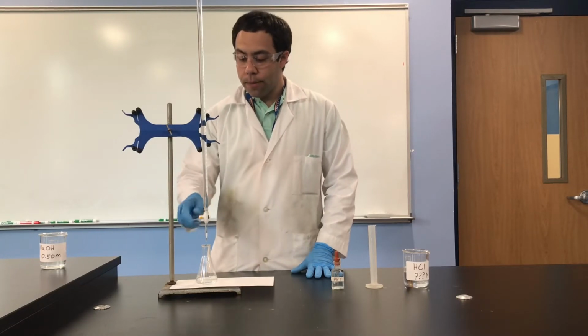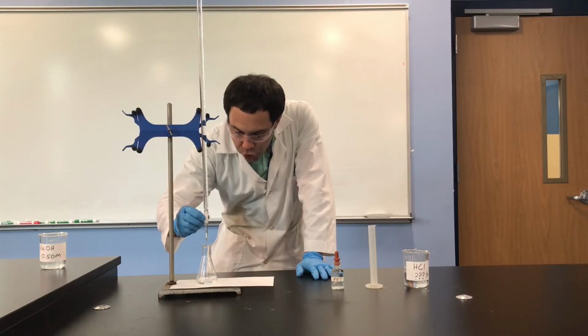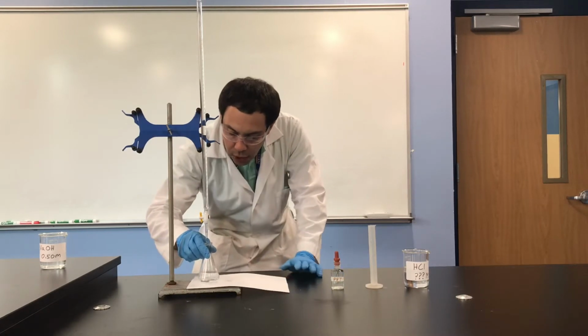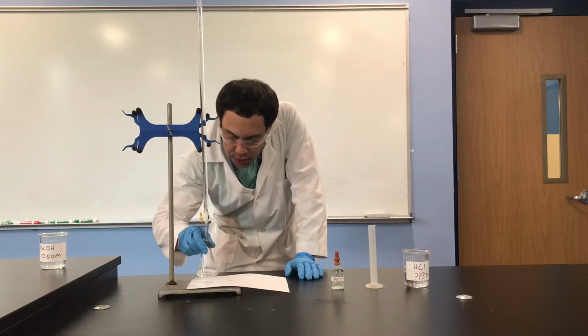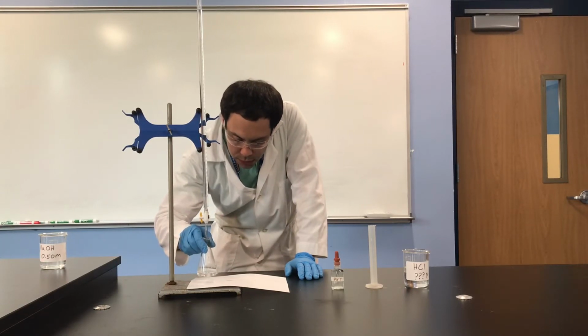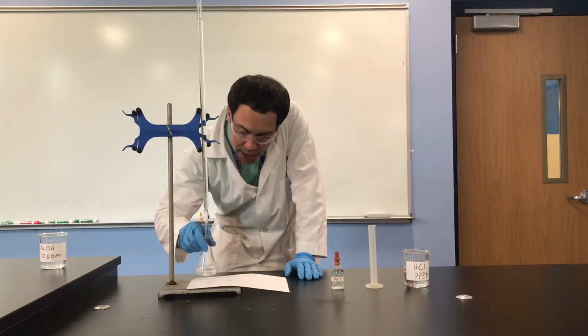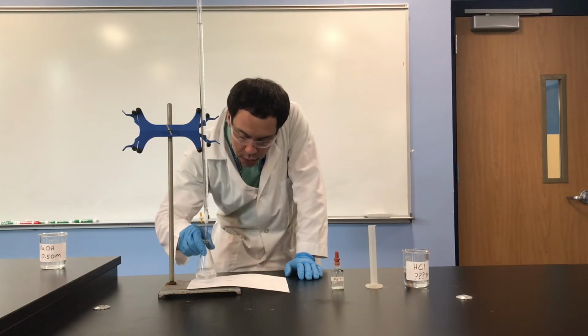So let's start. I'm going to slowly open the stopcock and drip the base slowly into the acid while stirring. So far it is clear. There has been no change yet. I can go a little quicker because I don't see any pink. As soon as I see pink, I'm going to slow this down so that I could do 1 drop at a time.